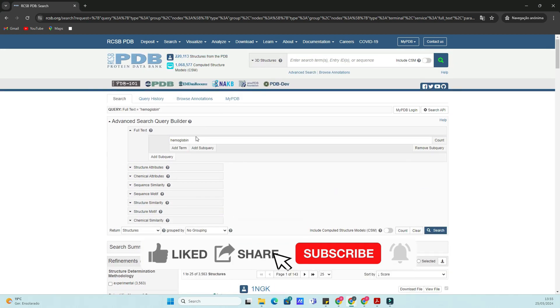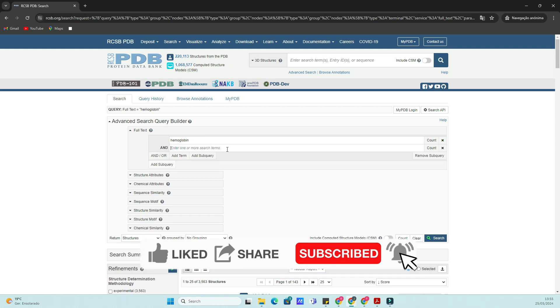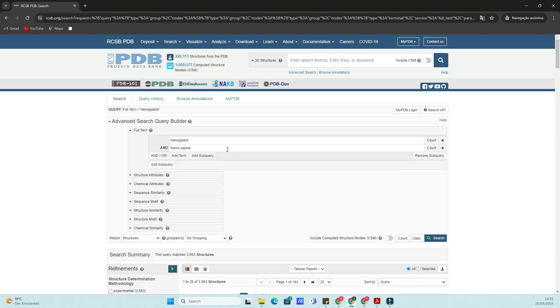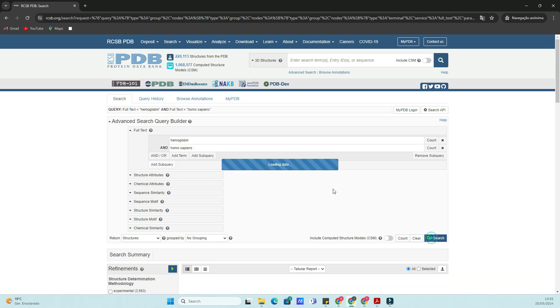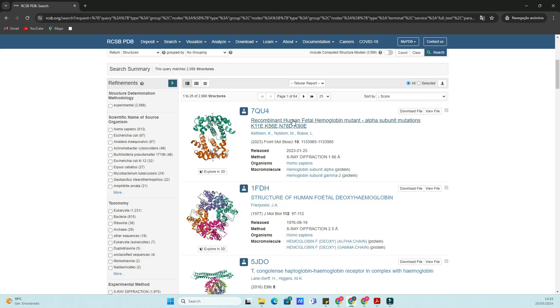Let's get started. First, let's head over to the NCBI website. Open your web browser and go to ncbi.nlm.nih.gov. On the homepage, you'll see a search bar at the top. Type in PDB and hit enter.